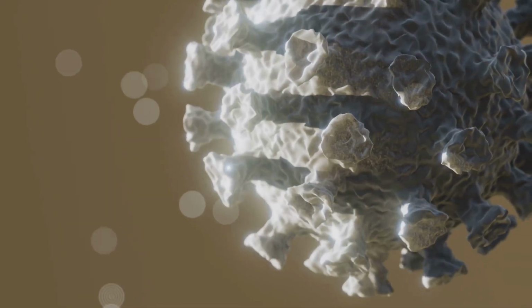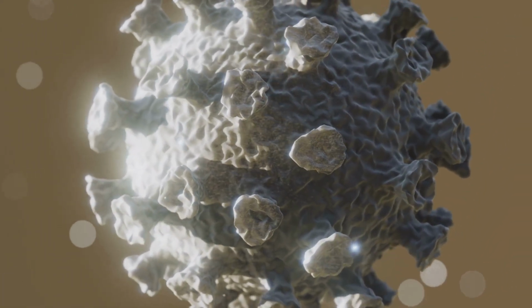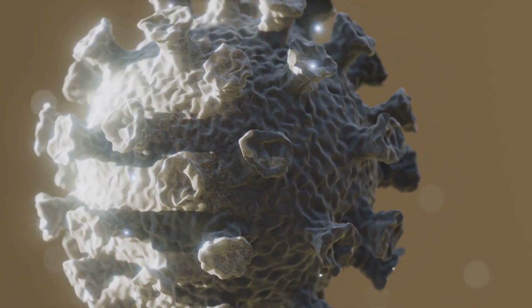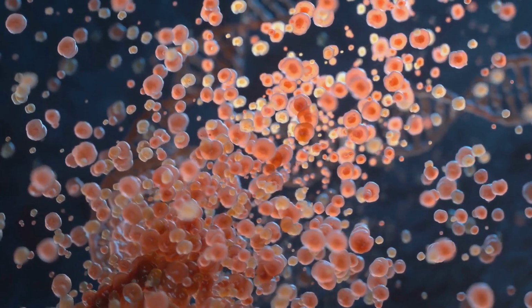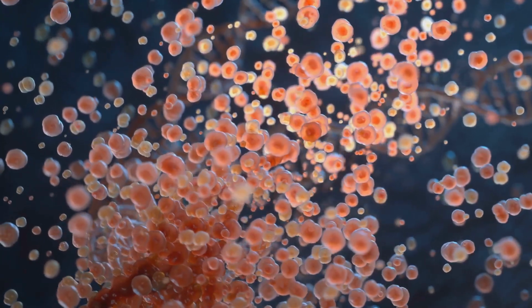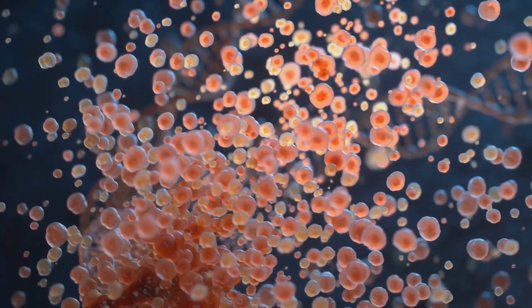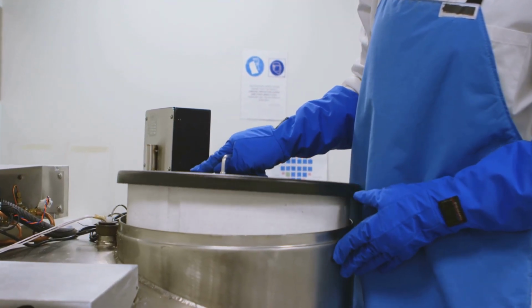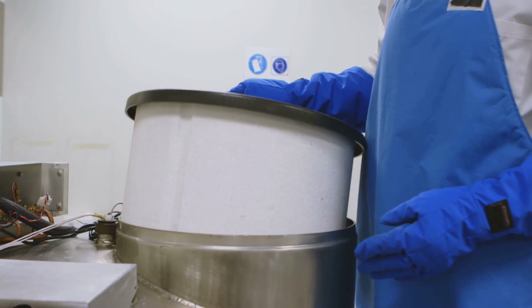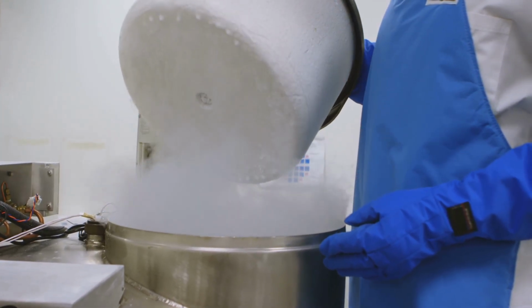Methods with cool names like STED, PALM, and STORM use fluorescent molecules and computer tricks to achieve resolutions as sharp as 20 nanometers. This allows scientists to watch molecules interacting inside living cells, bridging the gap between conventional light and electron microscopy. On the electron microscope side, a technique called cryo-electron microscopy, or cryo-EM, has caused a revolution in biology.